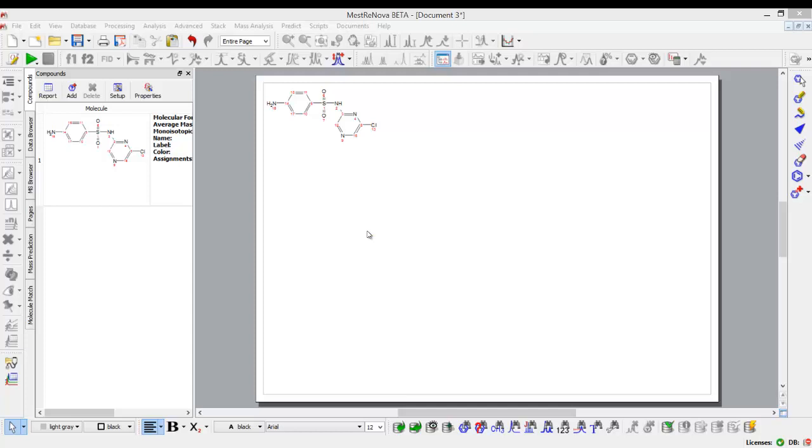I may have imported this as a MOL file or an SD file, maybe CDX from ChemDraw, copy-paste from any of the typical drawing applications, or I may have drawn it directly in MNOVA by using the drawing tool functionality.